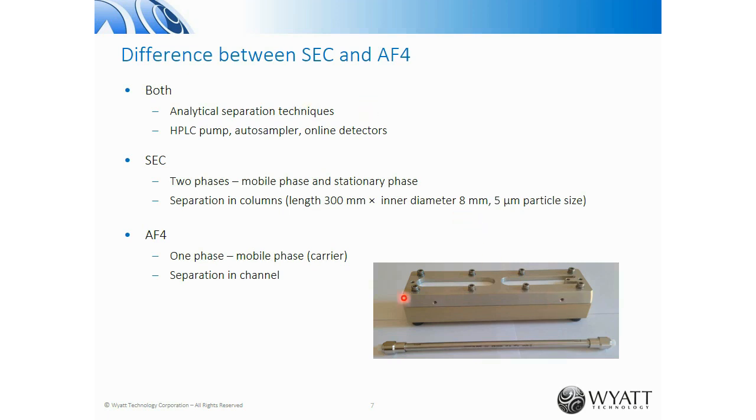The picture shows a typical AF4 channel compared with an SEC column of regular dimensions, 300 millimeters in length, 8 millimeters in inner diameter. Particle size is usually 5 micrometers.